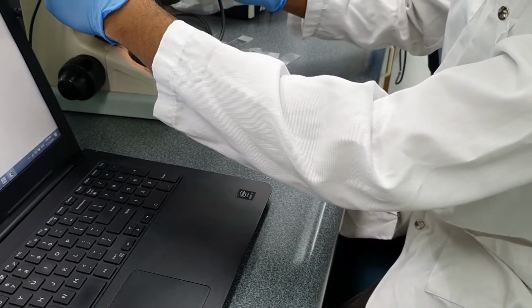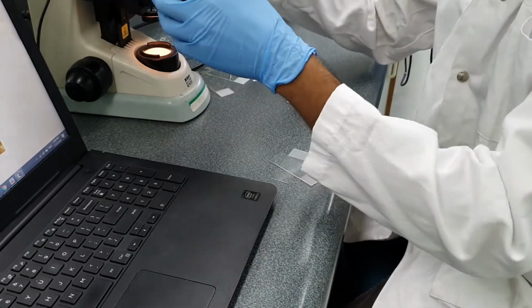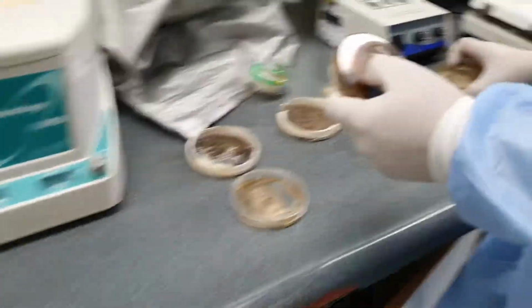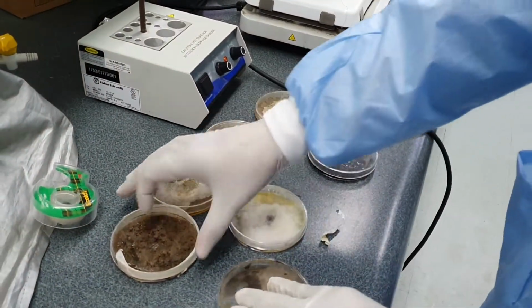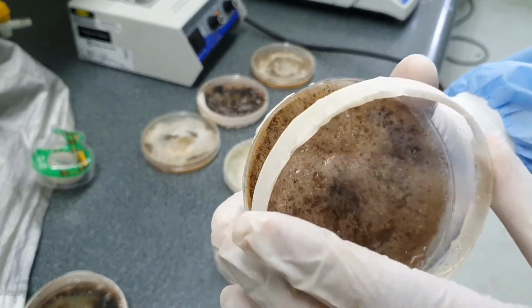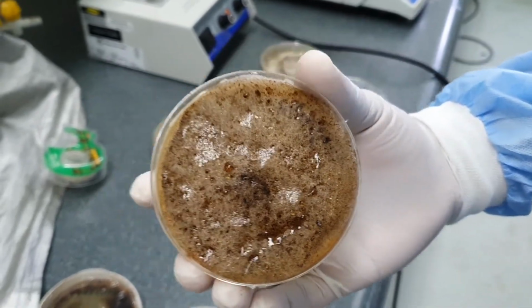The other two types of fungi include Rhizopus, right? And this is what it looks like on a petri dish, right?